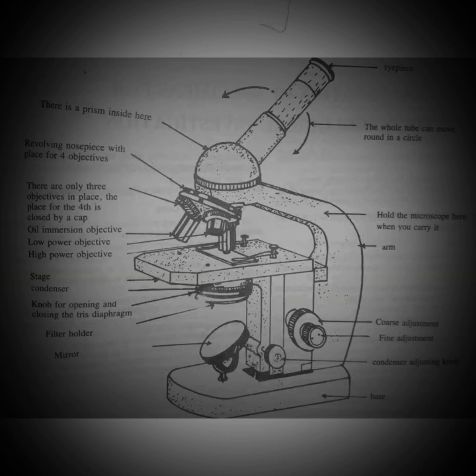Now there is the illumination system, from where you can take sources of light, like sunlight. So there is a mirror, you can see. This mirror is mainly a concave mirror. Sunlight will come and it will reflect to the stage.